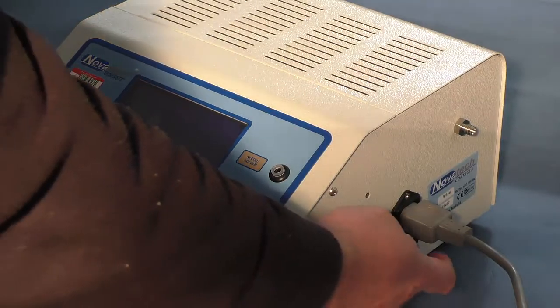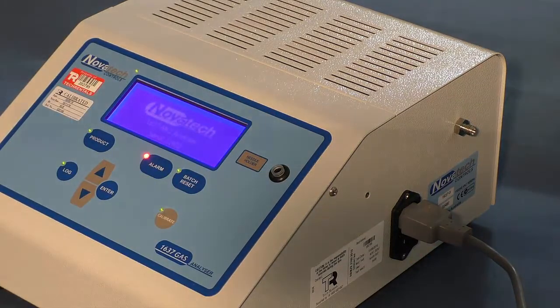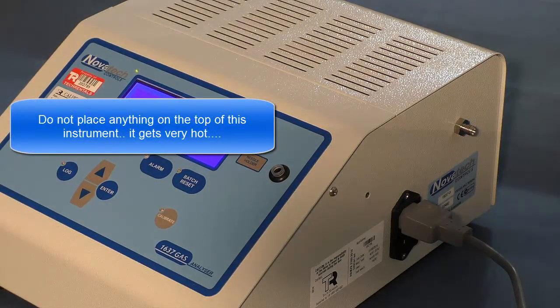To switch the device on, press the button. It takes about five minutes from turning on to reach operating temperature. While it's operating, don't place anything over the top vent as this could be a fire risk.